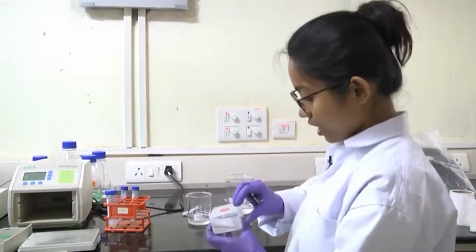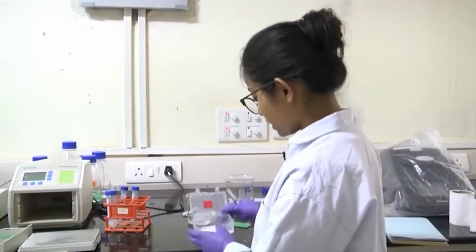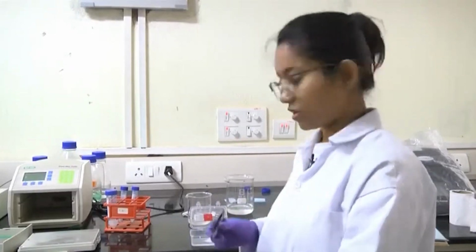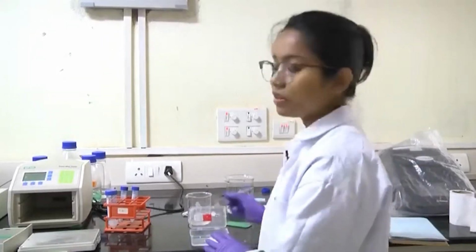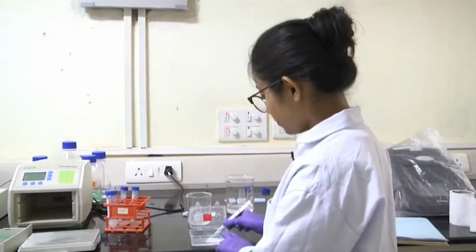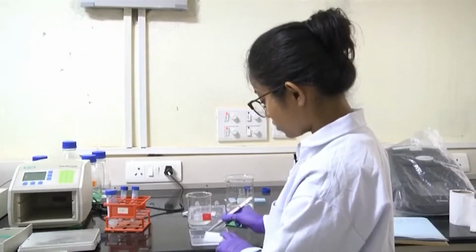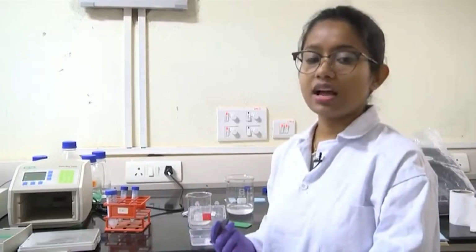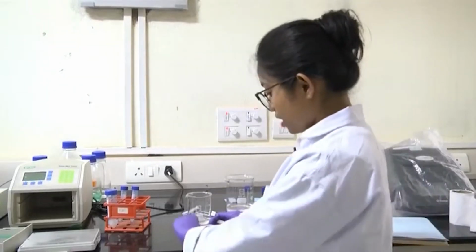and then at the end of it we will take out the membrane and put the substrate for this horseradish peroxidase enzyme, and then we will wait for the development of the band. So now after the washing is done, we will take out the membrane and put the substrate on top of the membrane, wait for 5 minutes so the enzymatic activity can occur, and then we will take out the blot and start the development of the blot.